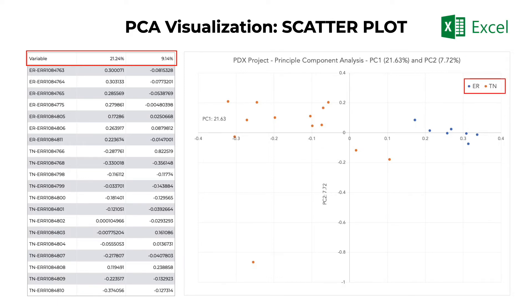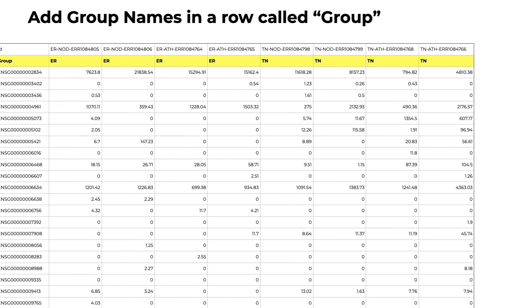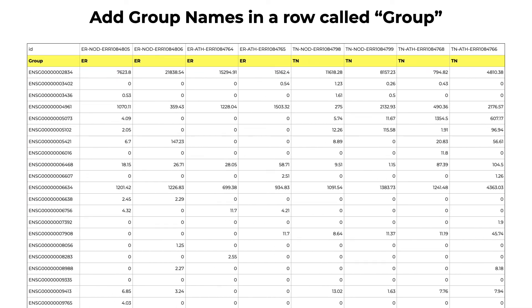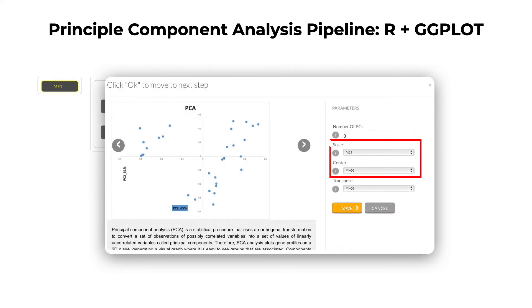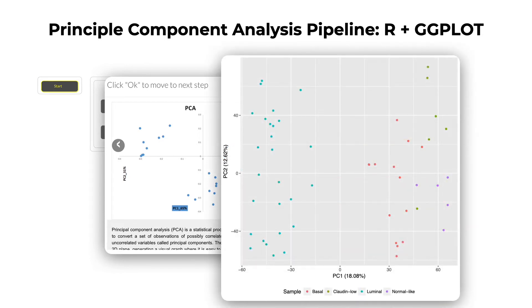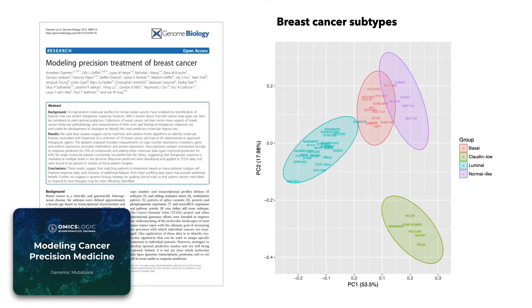Notice that we can see a distinction between triple negative and estrogen receptor positive samples by their position on the x-axis. We also see that there's an outlier sample in the triple negative group based on the y-coordinate. Another way to run PCA and annotate the results is to use R. First, we need to add sample labels in a row called group. Then we can use the data mining area of the tBioInfo platform and find the unsupervised analysis section, which implements PCA in R with ggplot outputs. In the PCA parameters, you can select options for data scaling and centering. The output is a PDF file showing samples colored by group name, and you will also get the actual R script.